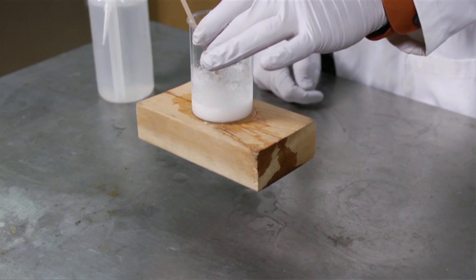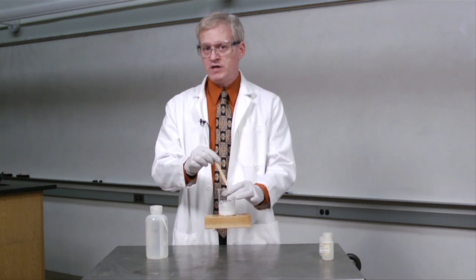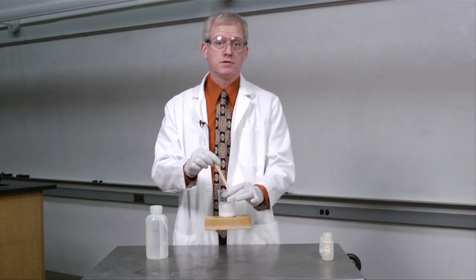The reaction is so endothermic that it has taken heat from the puddle of water, freezing it to ice that now bonds the flask to the block.